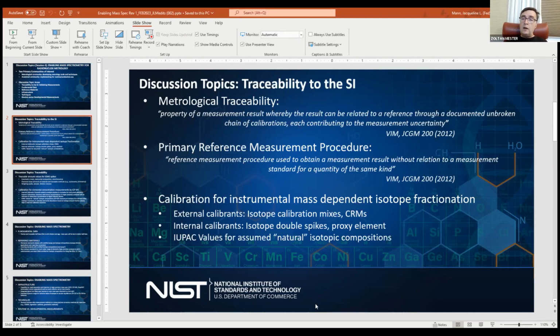I was asking this question also yesterday: it would be important to understand the uncertainty needs where the radiometric measurements community operates, because for some of those uncertainties, if I understand correctly, some of our mass spectrometry methods are pretty close to providing direct estimates.